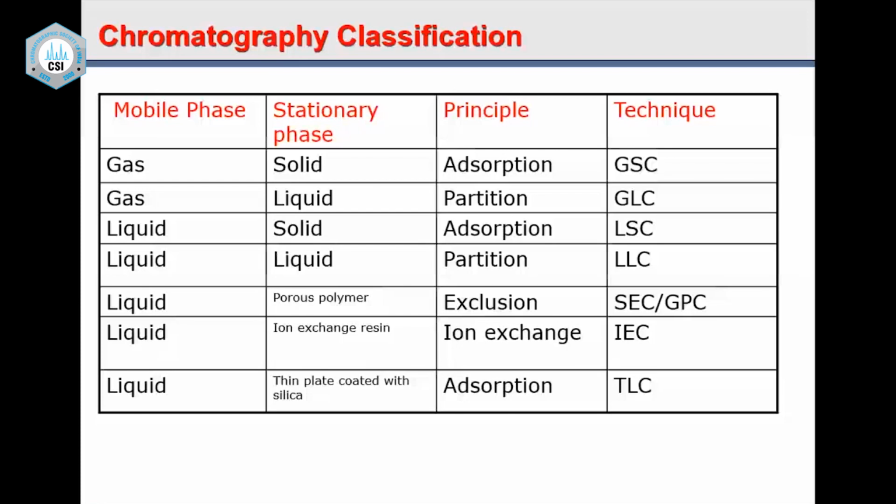Then we can use ion exchange resin, and that can be used for separation. So we can have two types of resins, cation exchange and anion exchange, and then we can separate the ions on the basis of whether the resin is cation exchange or anion exchange. We have a separate lecture for that, so you will hear about this technique particularly well.